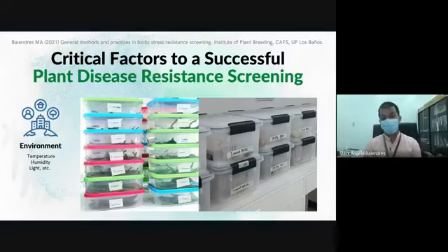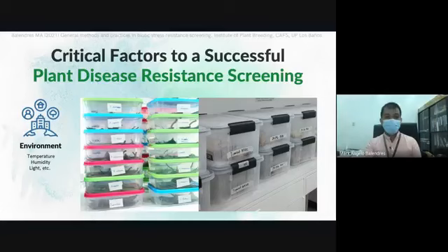For the bigger one, you see there's a difference with the smaller one in terms of the production of abundant moisture at the edge of the container. So it's always good to use the same size and the same brand of containers, particularly if you're publishing, because it might have an effect on the outcomes of your experiment.